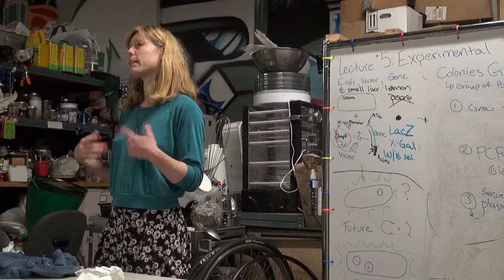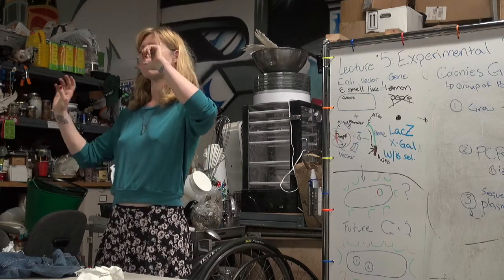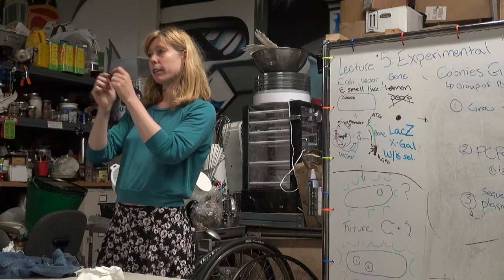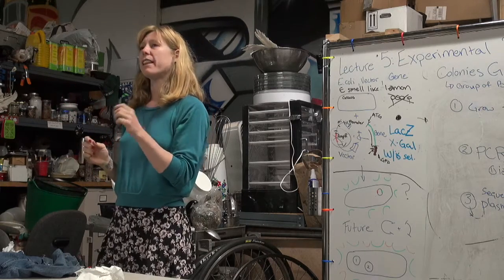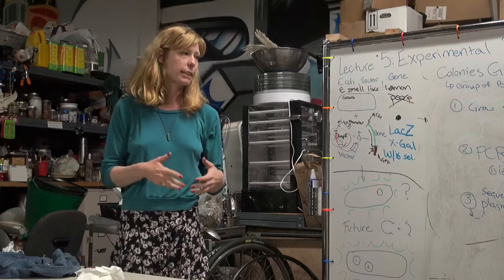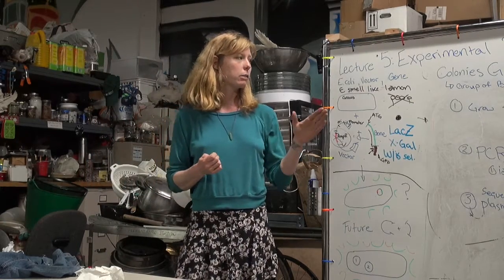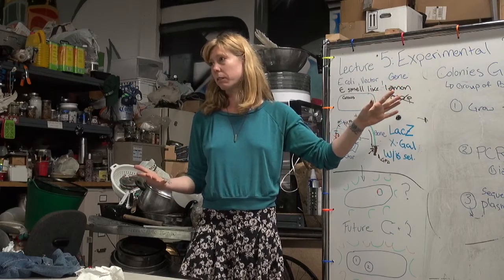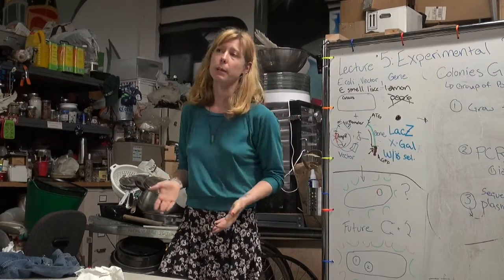Normally, once I've made a solution, since antibiotics tend to come in a powder that you mix into water, methanol, ethanol, whatever it dissolves into, I keep it in the freezer. To test that the antibiotics are working, you grow cells that don't have resistance to that particular antibiotic on a plate with the appropriate amount of antibiotic.